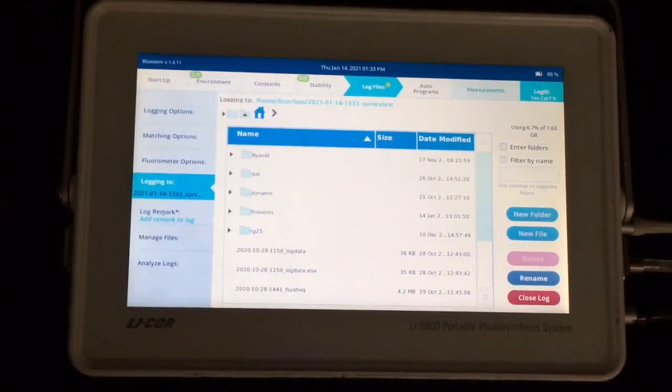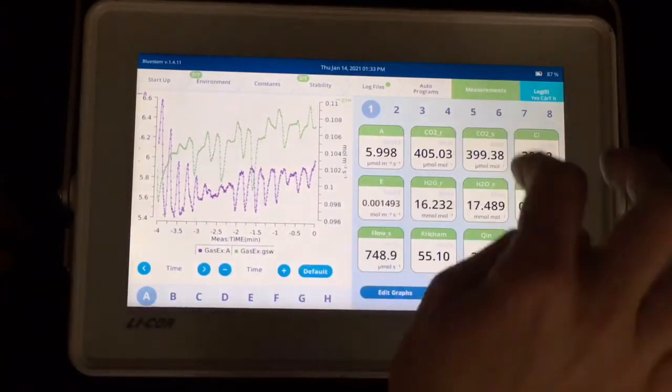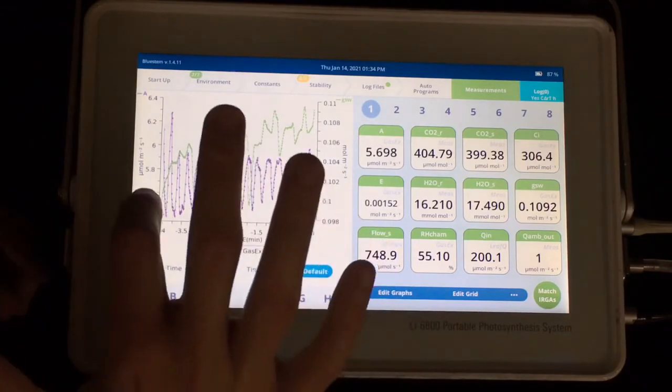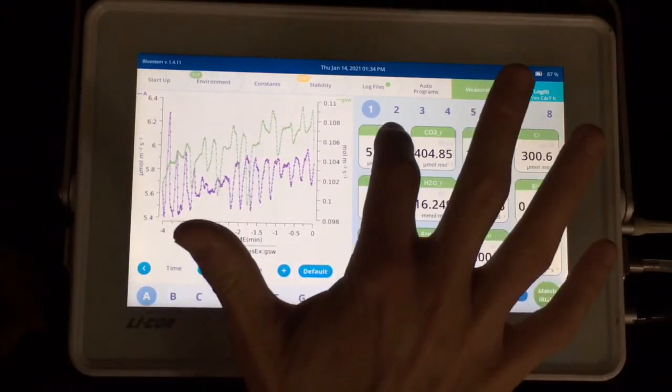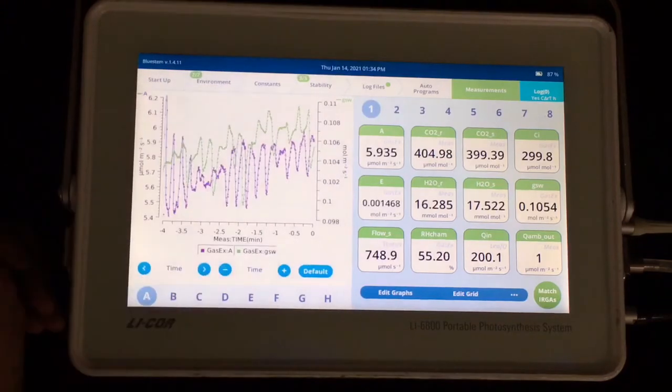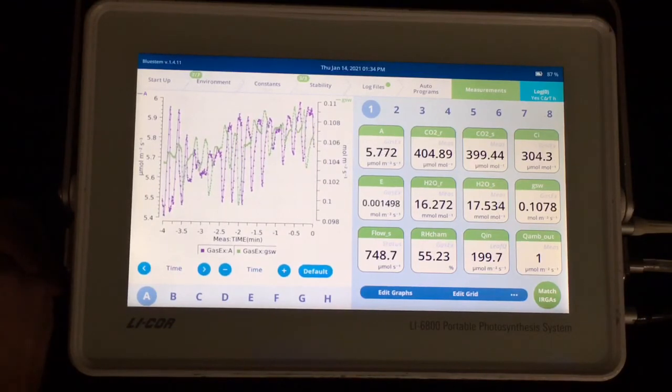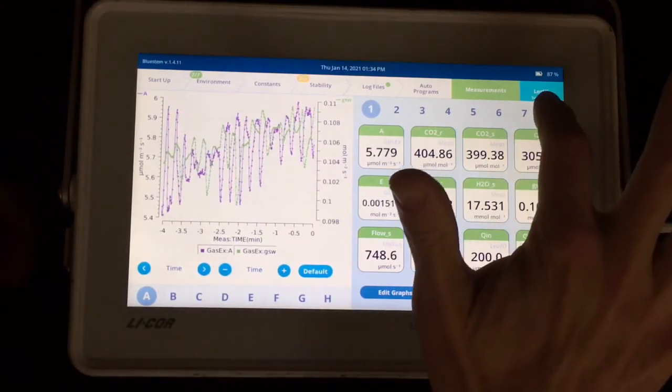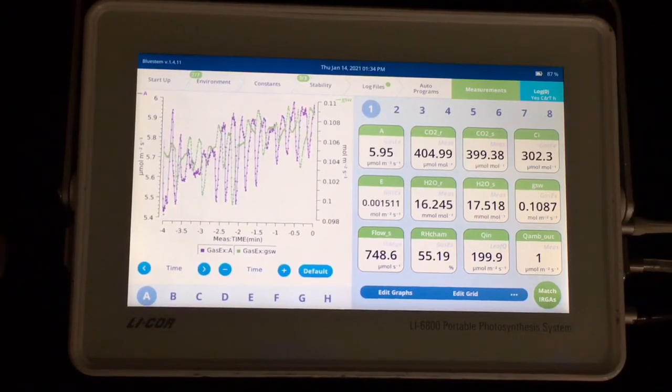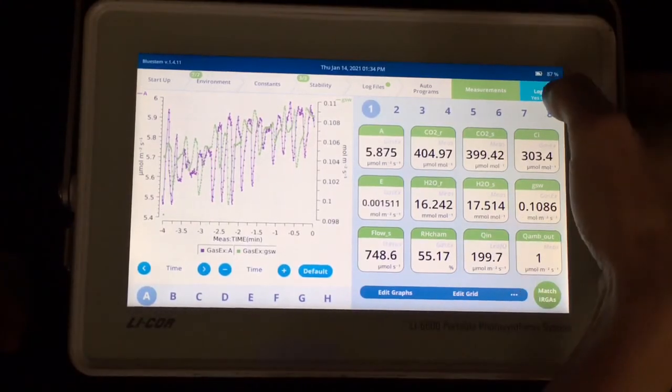Now I've got all my environmental controls set up. I've got a log file open and I'm ready to log data. And I can come to my measurement screen and see if I'm stable and ready to log a data point. And you can see that by watching some of the graphs. You can look at the variables over here on the grid. So this is a pretty tight constraint on assimilation as well as conductance. This leaf is fairly stable. I would say that's probably ready to log a data point. You'll see up here that where you log a data point is you push this button here or there's a button on the sensor head you can press. And it gives you information on whether it's going to match or not with this data point. And in this case it is.